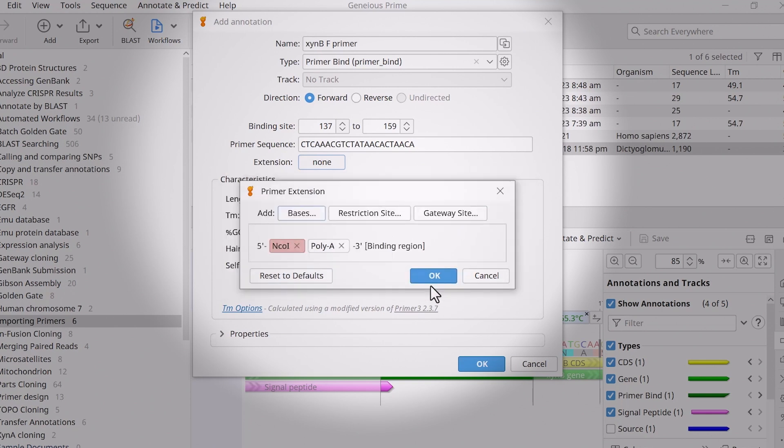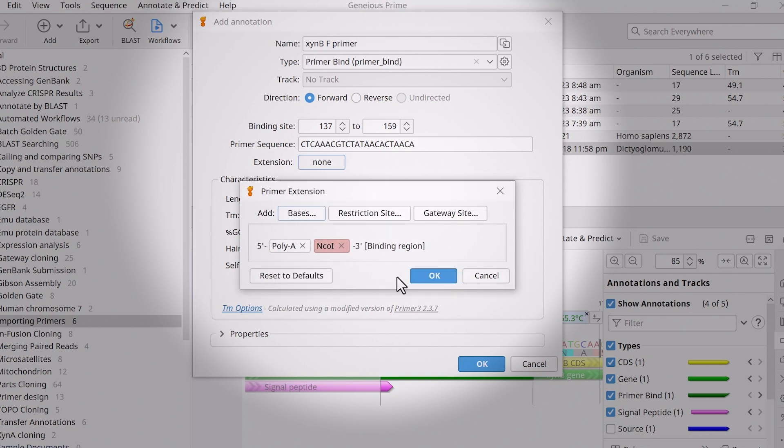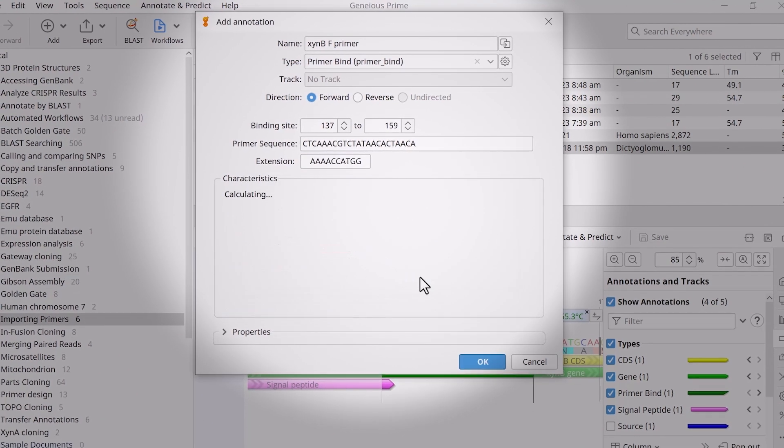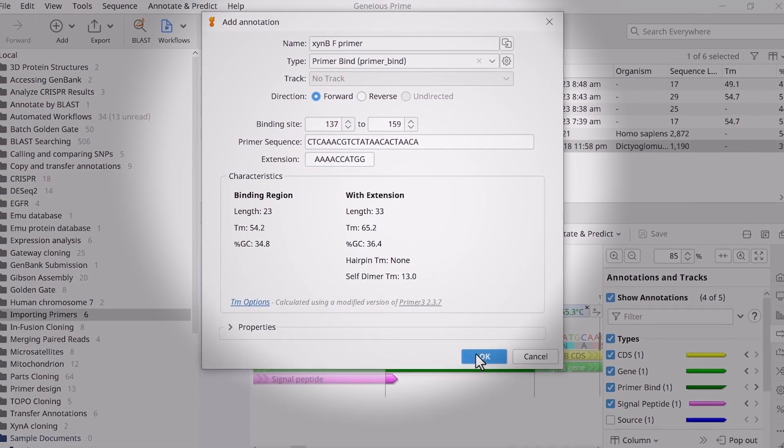In the preview window, click and drag on each extension to reorder them. Click OK and OK again to create the primer.